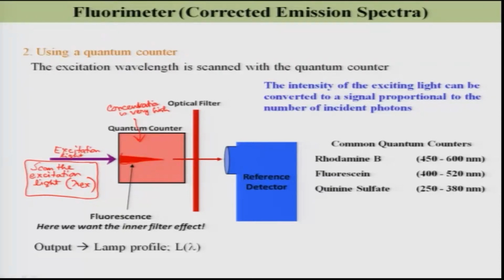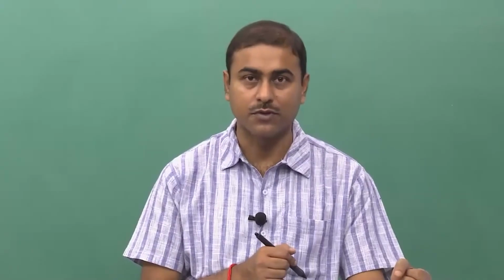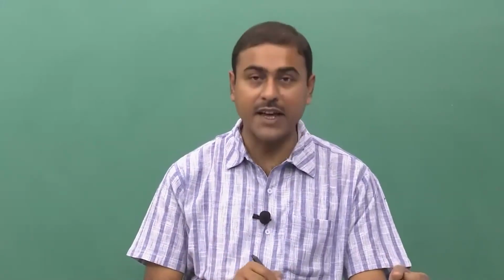So, when you scan, depending on the spectra of the lamp output, the light intensity at different lambda excitation wavelengths will vary, as simple as that.